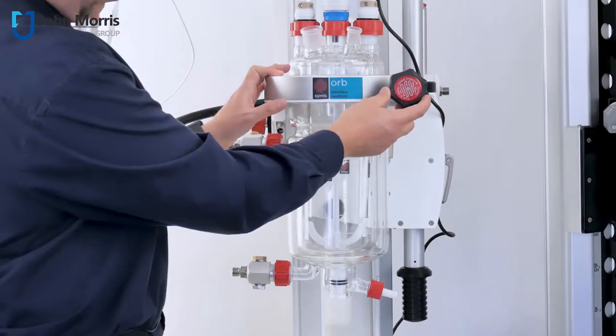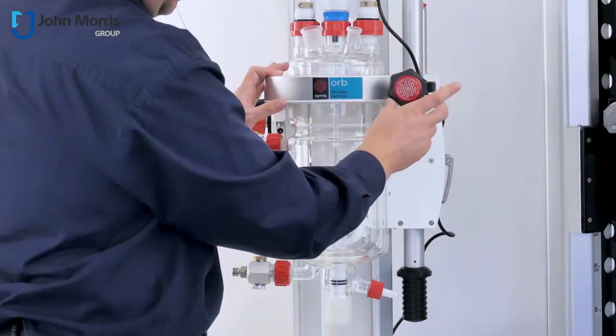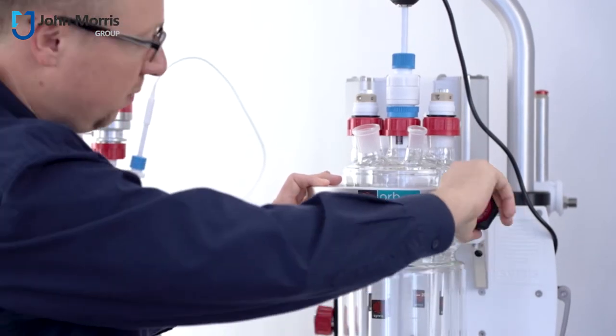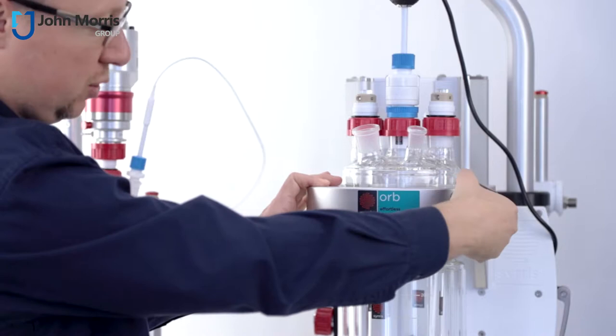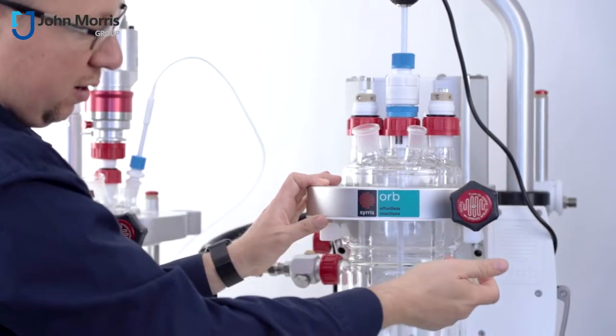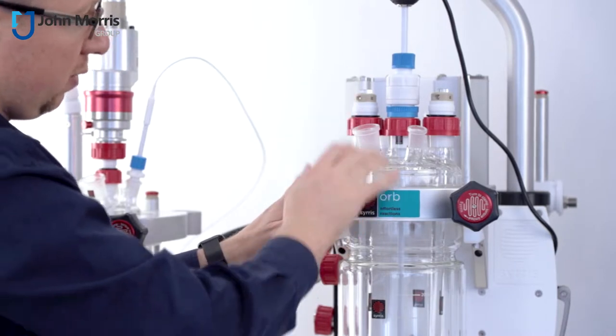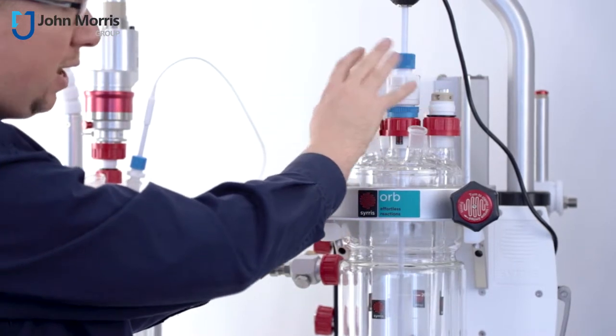We also have the same torque limited knob so to show you how that works no matter how tight it is I can't over tighten and crack the glass but if we were to open that I can show you just how easy it is to remove the components and we'll do that once we lift everything else up and out of the way.